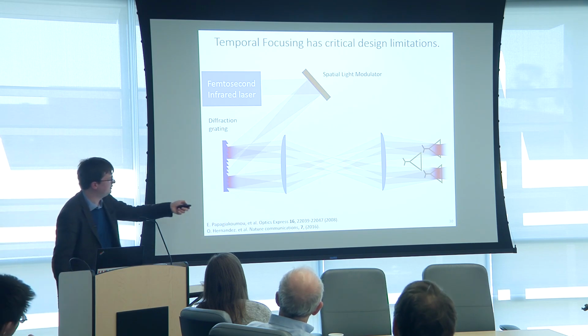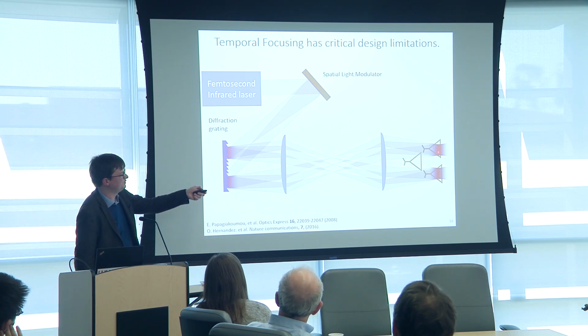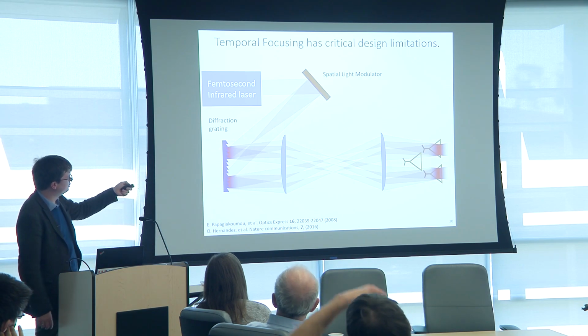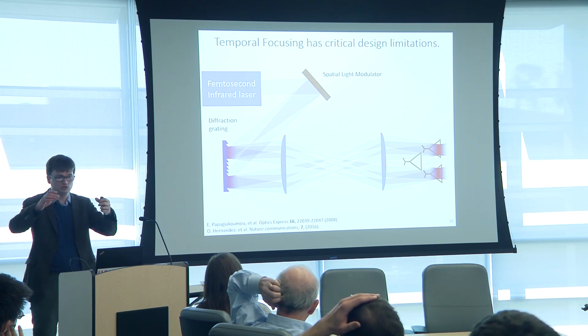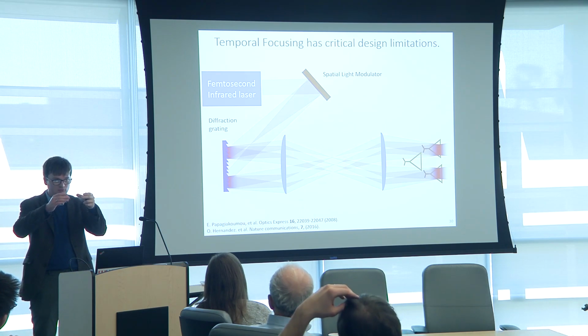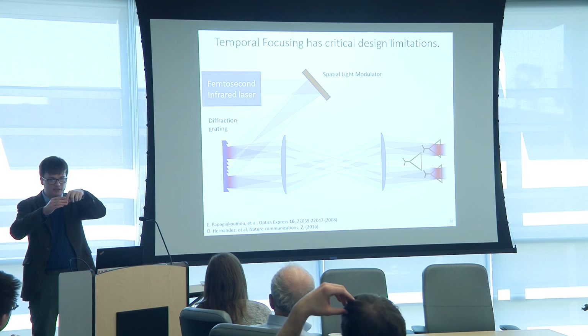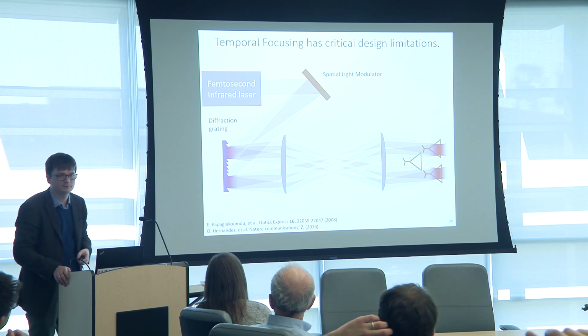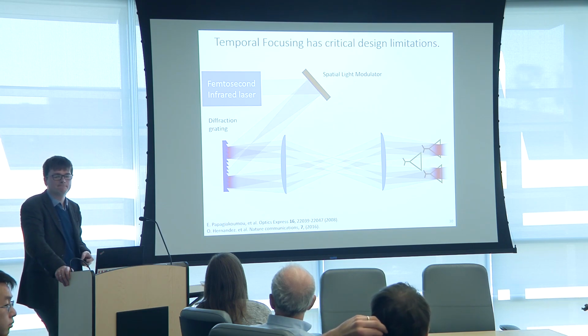So this would be a magnified version of what you would see under the objective, and then it is relayed to the diffraction grating. So functionally what you do is you create a virtual image of the diffraction grating in the brain, and on this diffraction grating you make a custom 2D pattern that you can draw with your SLM with 2D holography. Got it.